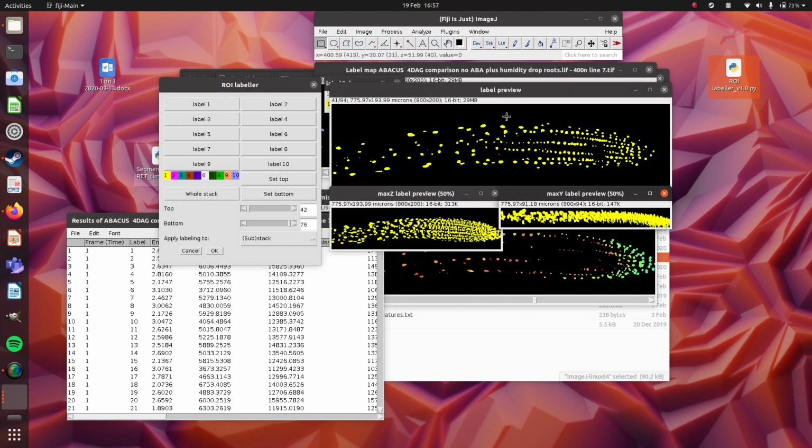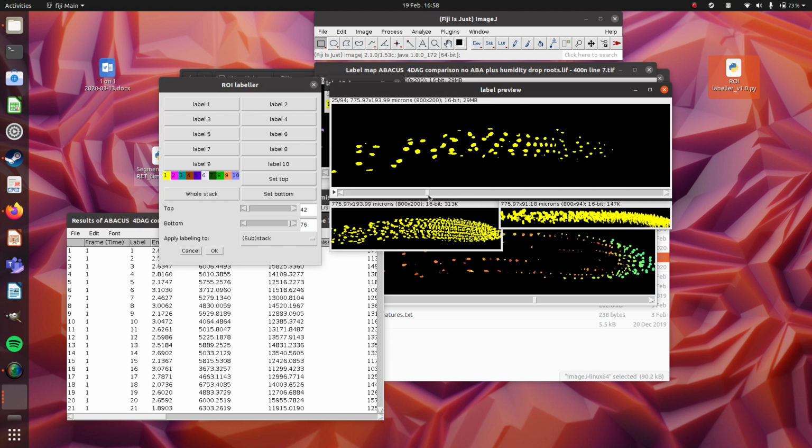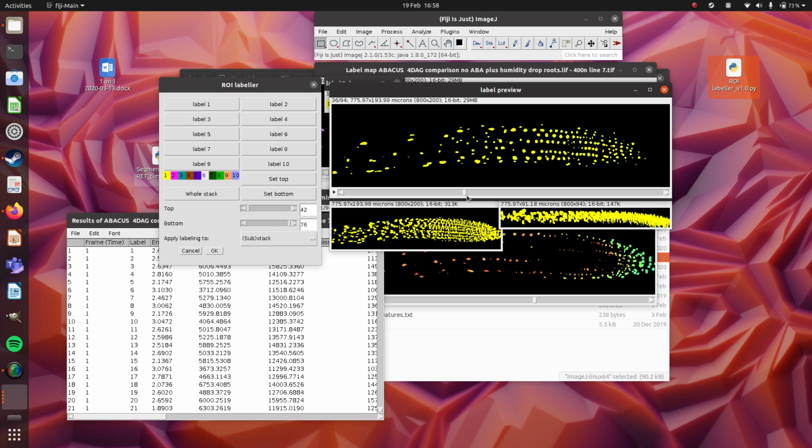There we go. And then I'm going to say, okay, I'm going to label from around here back, and give that label 2.